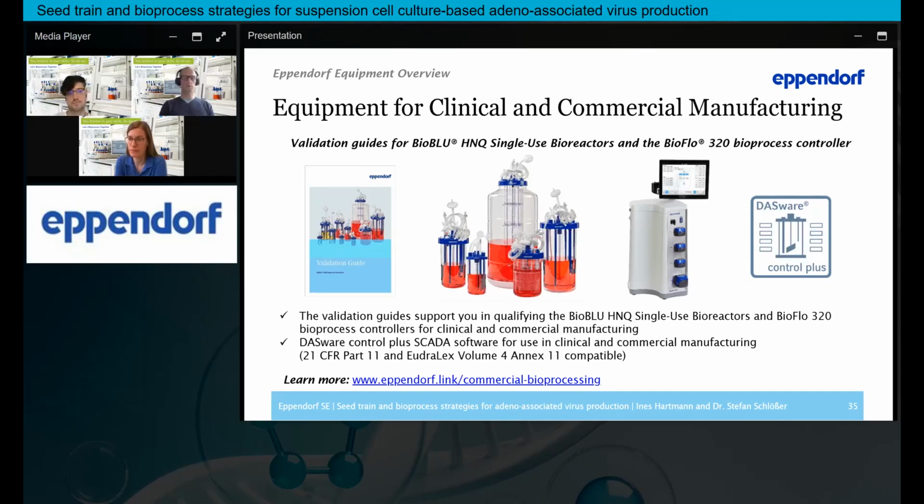And detachment from those microcarriers is also done like in an adherent cell culture with trypsin, or how does that work? This is usually the way. There are different variants of it, but this is usually the standard at the moment. For producing bioreactors, the detachment step is not so critical, because you usually take your product out of the supernatant. So for this, it's no problem, but usually it's the typical detachment methods, even though people are working on alternatives for this as well.